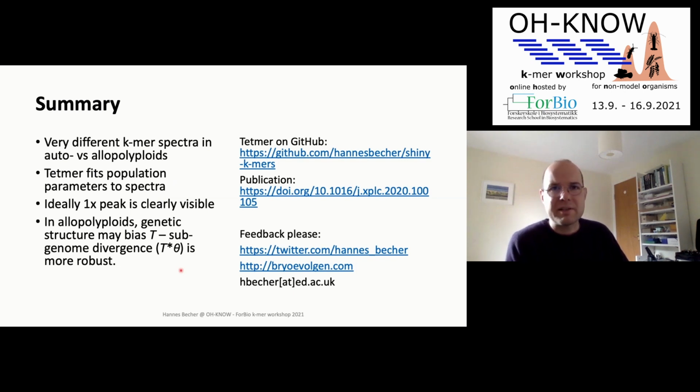Ideally, for these analyses to work, and that's not Tetmer specific, that's a K-mer thing in general, you have a clearly visible 1x, 1n peak. And even if there is no 1n peak, it's good to see that there's nothing there. It is tricky to do an analysis if there's much overlap with contamination K-mers.